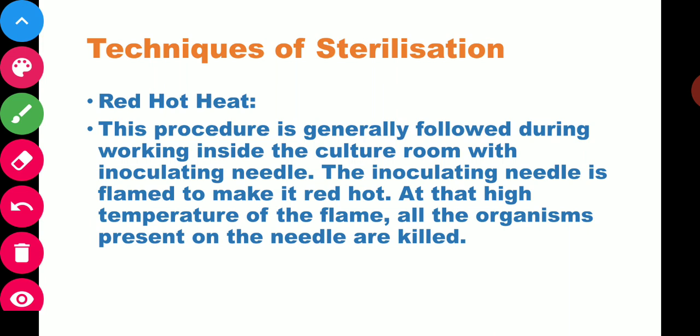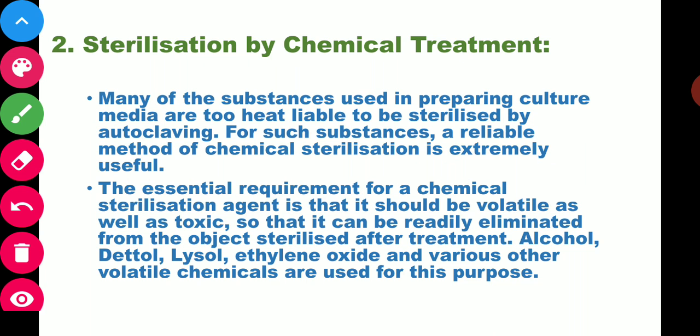Red hot heat: this procedure is generally followed while working inside the culture room with an inoculating needle. The inoculating needle is flamed to make it red hot. At that high temperature of the flame, all the organisms present on the needle are killed.